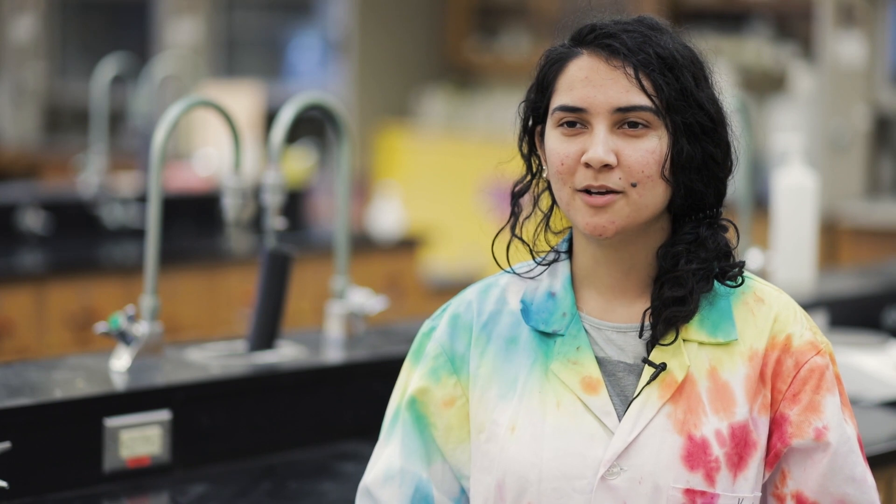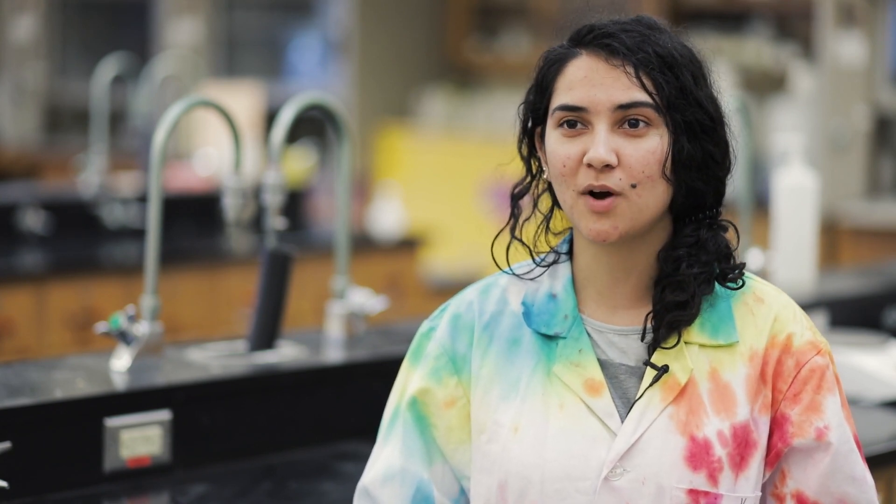It's not that you need to take a very long course or training before using it. I feel like anybody could use it. Even a biology student could just walk in on the first day and get a hands-on experience of using NMR.